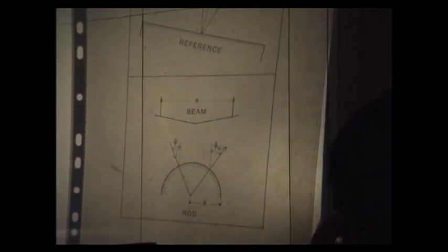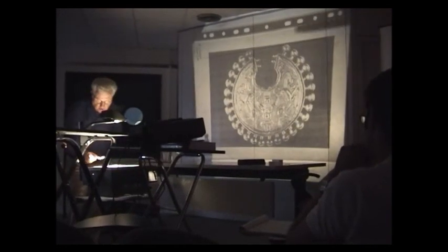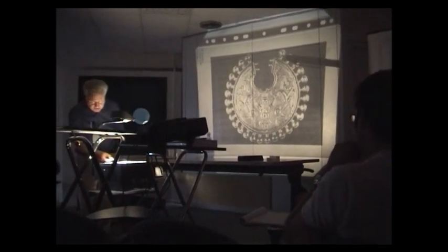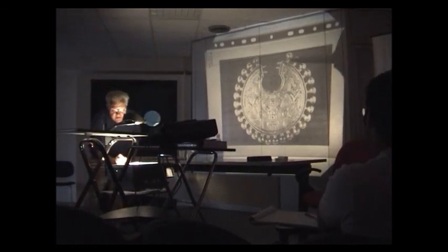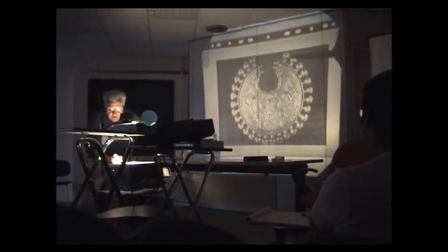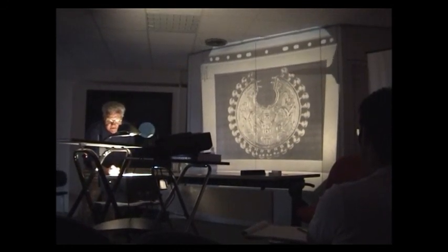Then you see the outgoing path of X-rays in the material, decoration, and those decorations are composed by a cylinder here, a first hemispherical cap, and a second one.